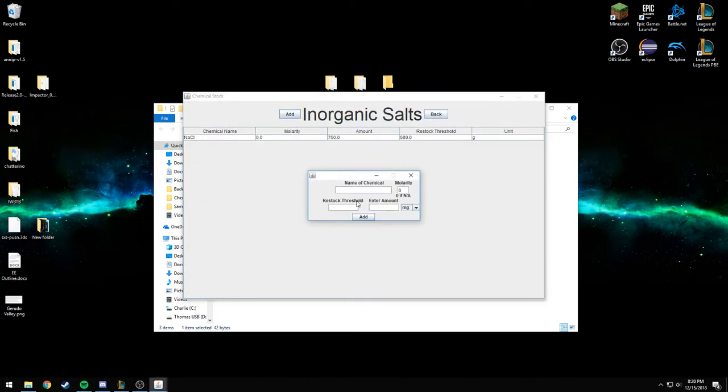Say we want to add some in-solution potassium hydroxide. Let's make it 1 molar and then 450 milliliters, add.